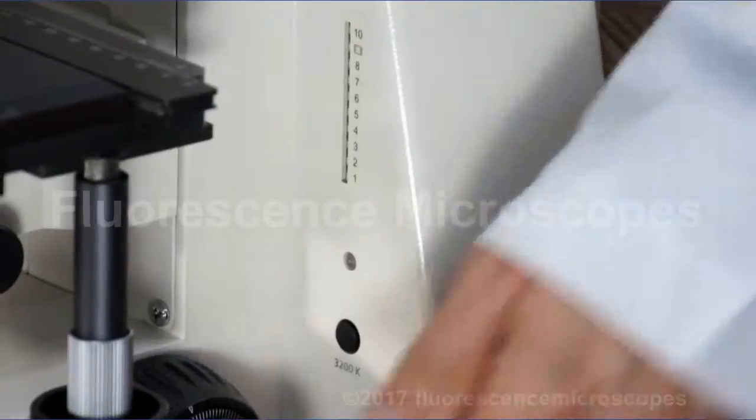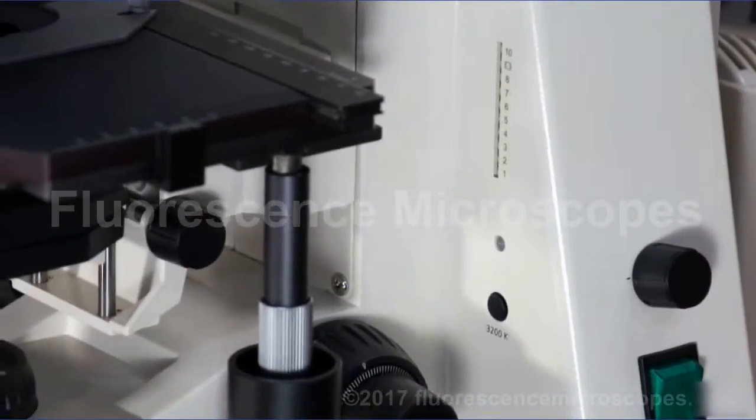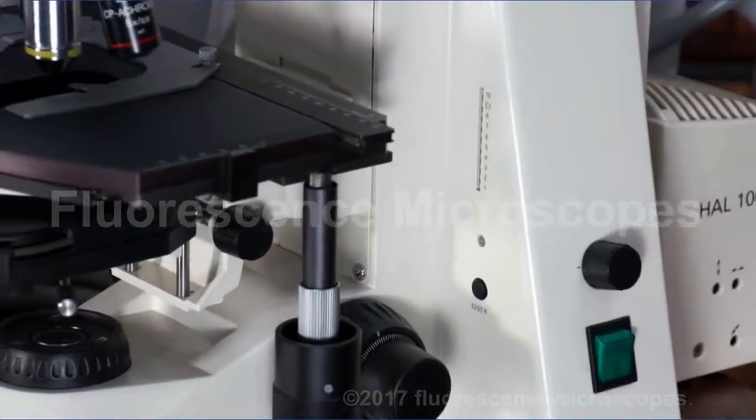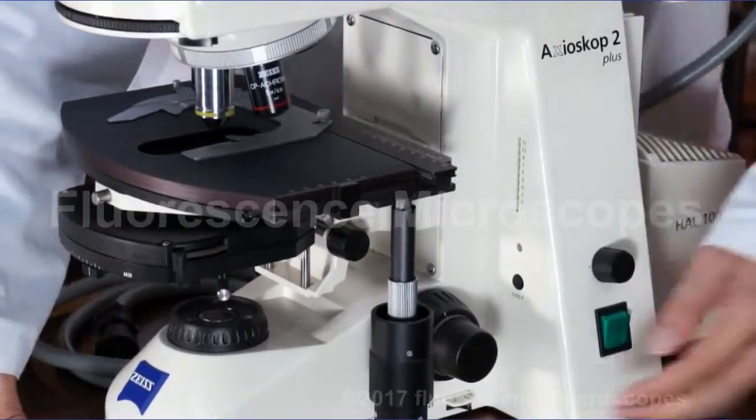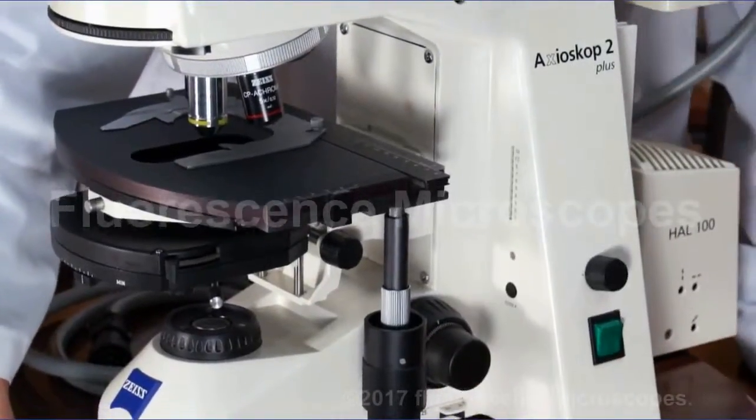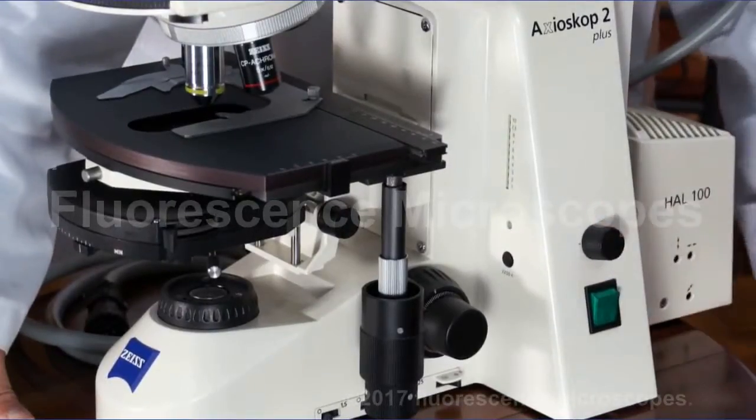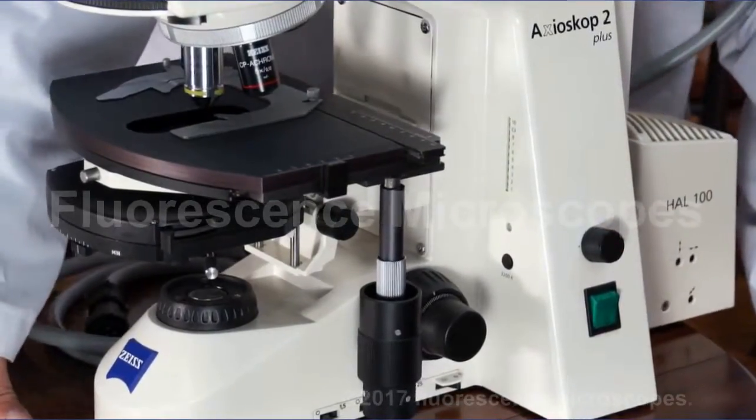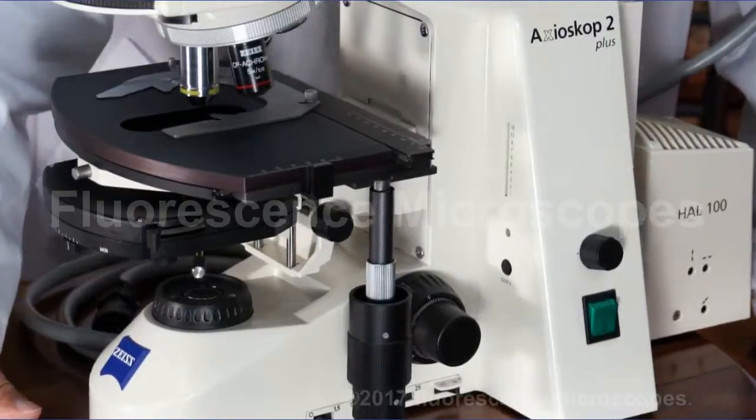And your neutral density filters, the reason for those is you may not want to change the color intensity of the light whenever you're looking at a specimen, but it may be way too bright for you. So that's why you use a neutral density. If you just change this light intensity, what it's doing is changing the voltage. And that voltage going higher or lower is also going to change the color temperature of your bulb.